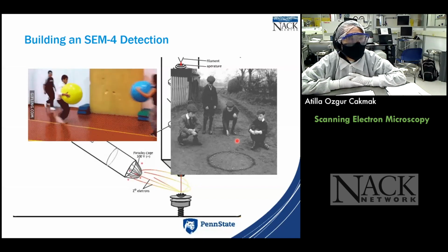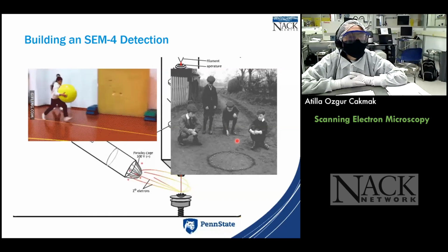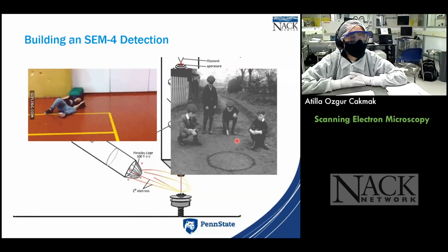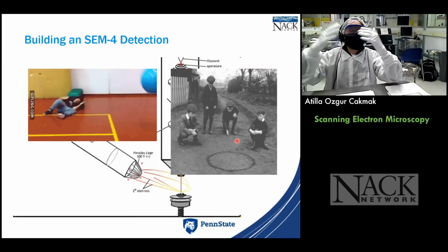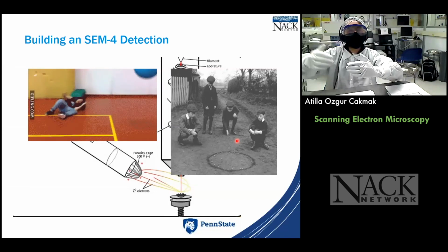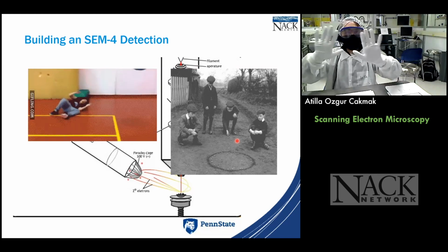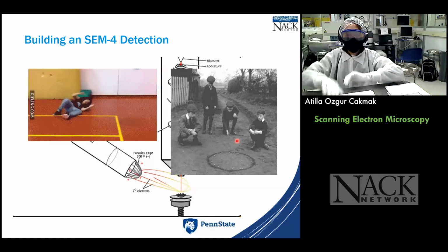The area that gives us the most blue electrons, if you think of it that way, will be brighter, just like Wes was saying. The contrast will be formed between the locations where we get fewer and more blue electrons. So we will have a black and white kind of contrast that way.